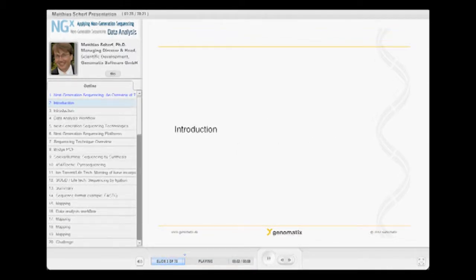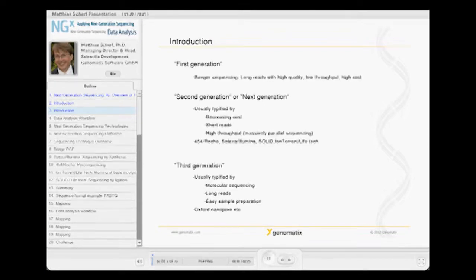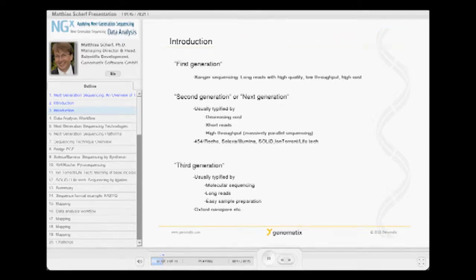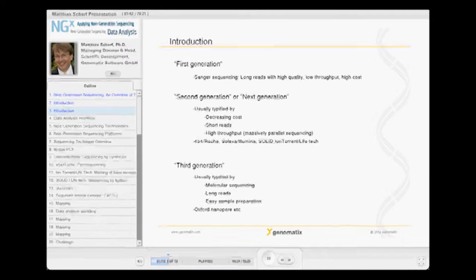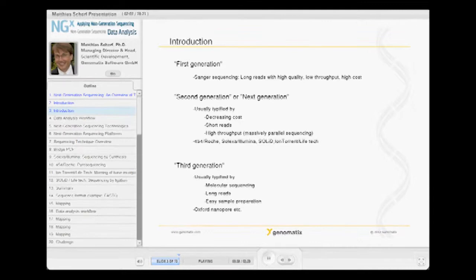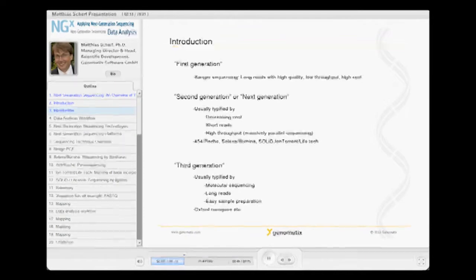So, starting with a little introduction, when we're talking about generations of sequencing systems, we should not forget, when we're talking about second generation, about the first and of course probably what's coming next, the third generation of sequencing. I think it is widely accepted that for the first generation, the most prominent example is the Sanger sequencing. And Sanger sequencing provides us, as we all know, with kilobase-long reads at a very high quality, but with low throughput and at a very high cost. So this changed now really rapidly with second generation or next generation sequencing, which brought down the cost dramatically. So we're not talking anymore about $3,000 or more for a million base pairs. We're now talking about 7 cents up to $10 for getting a million bases.